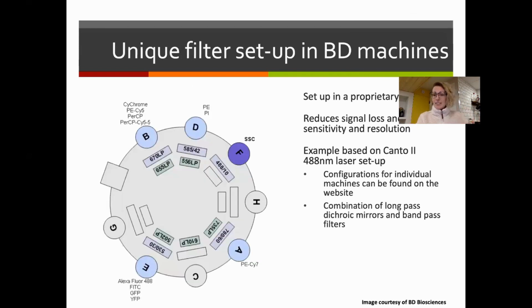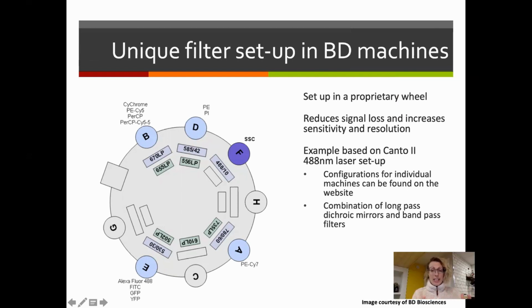So inside this thing, man. Inside a cytometer, you'll have some sort of apparatus that allows the light to pass from filter to filter to filter, ideally without a loss of signal between the filters. So this is a base setup of one of our filters for an instrument in the flow cytometer. Again, this is going to be different for individual machines and how different manufacturers set it up. So this is not a hard and fast rule, but the general theory applies across the board.